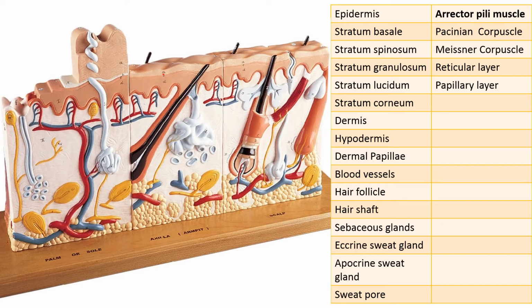Shall I do that for you one more time without all of the arrows? Thick skin, this is the epidermis. Thin skin, this is the epidermis. All right. So you are responsible again for the layers of the epidermis. Most superficially, you have the stratum corneum. Now, since we looked at thick skin on the last slide, I'm going to show you the same thing on the thin skin. So the stratum corneum is basically this pink layer that's very superficial right here.